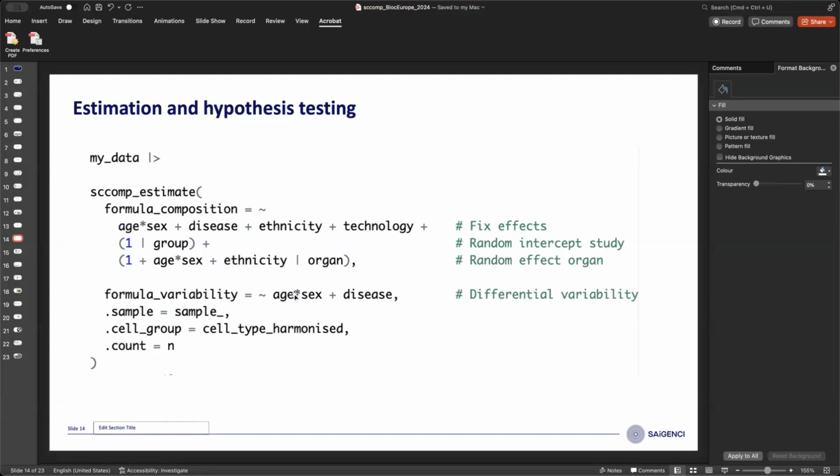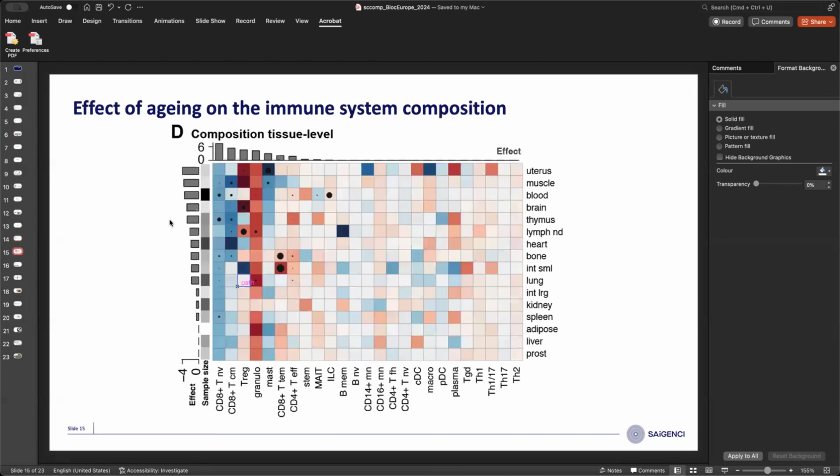When you're thinking of age and sex, are you doing something like pre- and post-menopause? Not in this case. Some relationships might not be linear, and again, the model could become more and more complex. It's good, if you have functions that ask the model to produce the data, because then you can see if your model does not fit the data. Non-linearity can be one of those cases, and definitely you could encode that into the model. It's a good point.